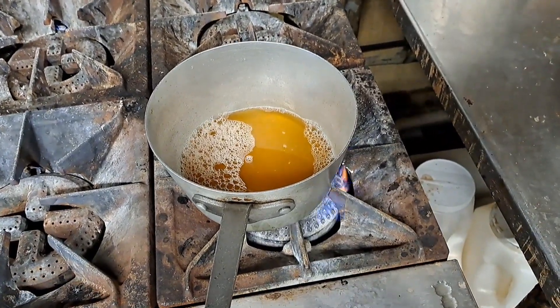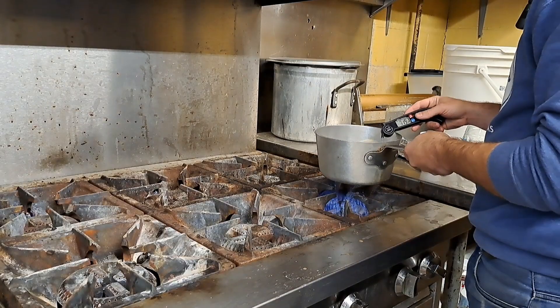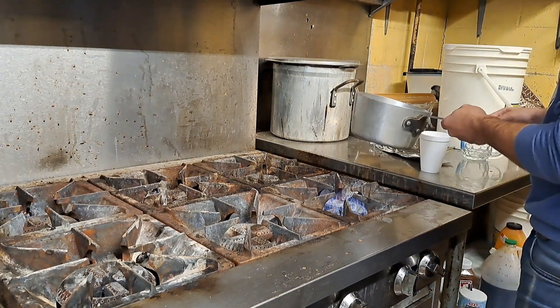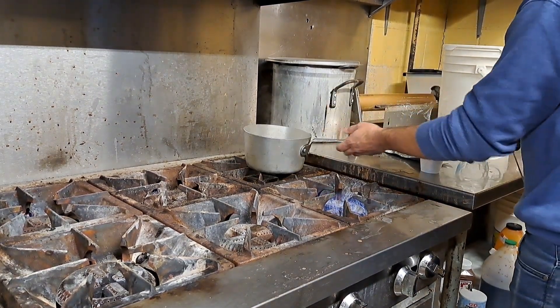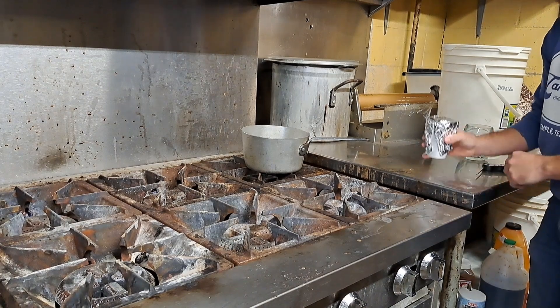I'm going to heat this sample up. The goal is to get it to about 140 degrees Fahrenheit. I usually shoot for a little bit higher than that because I don't have any means to hold it at a specific temperature, so I'm going to bring it up to about 150–160 and then let it sit in a styrofoam container so that it's as insulated as possible. Let it sit for at least 15 minutes and hopefully it will express all of the diacetyl that's in there. It's right about 150 right now, so I'm going to go ahead and pour it in here and put it inside another styrofoam container to keep it nice and insulated.